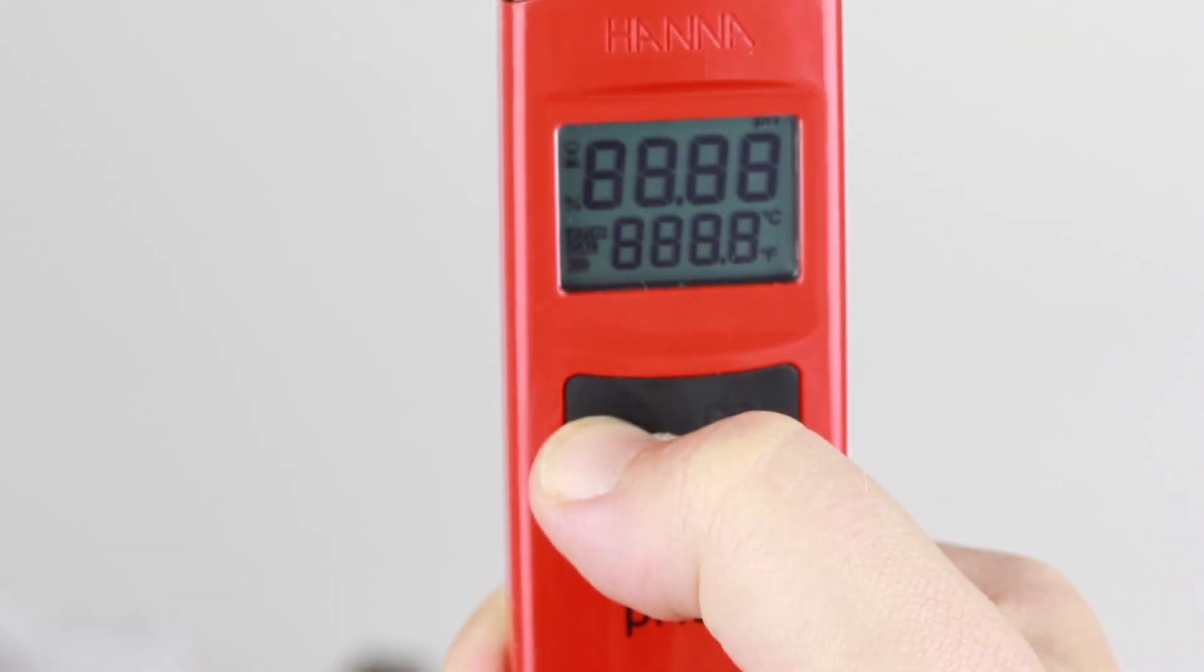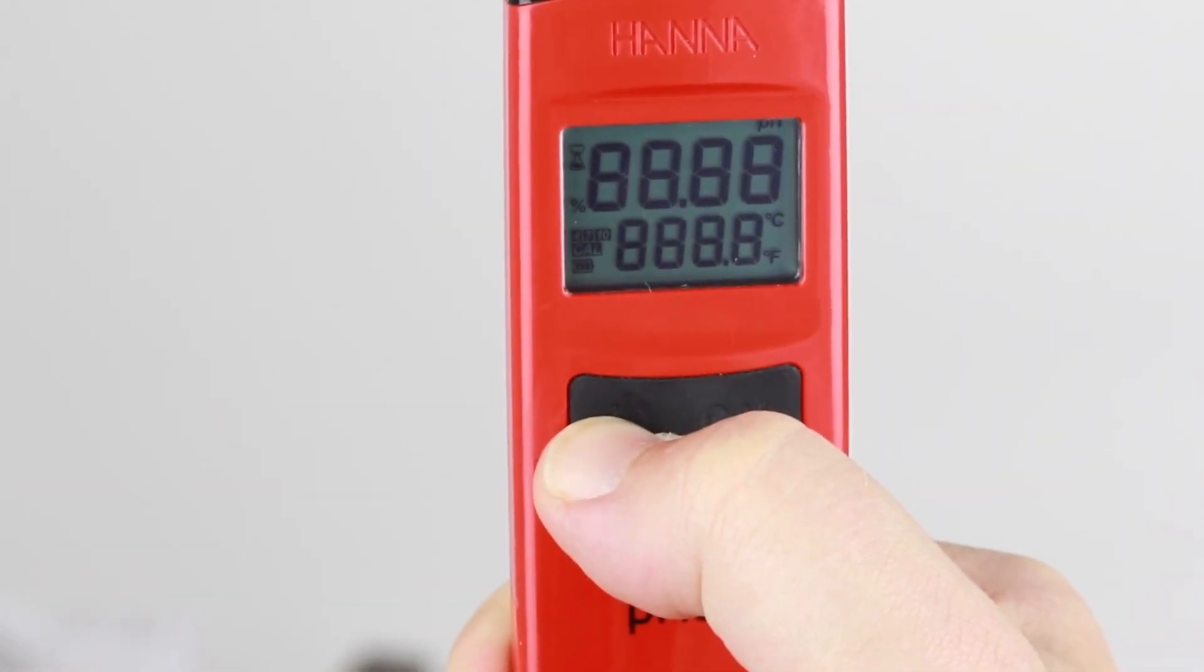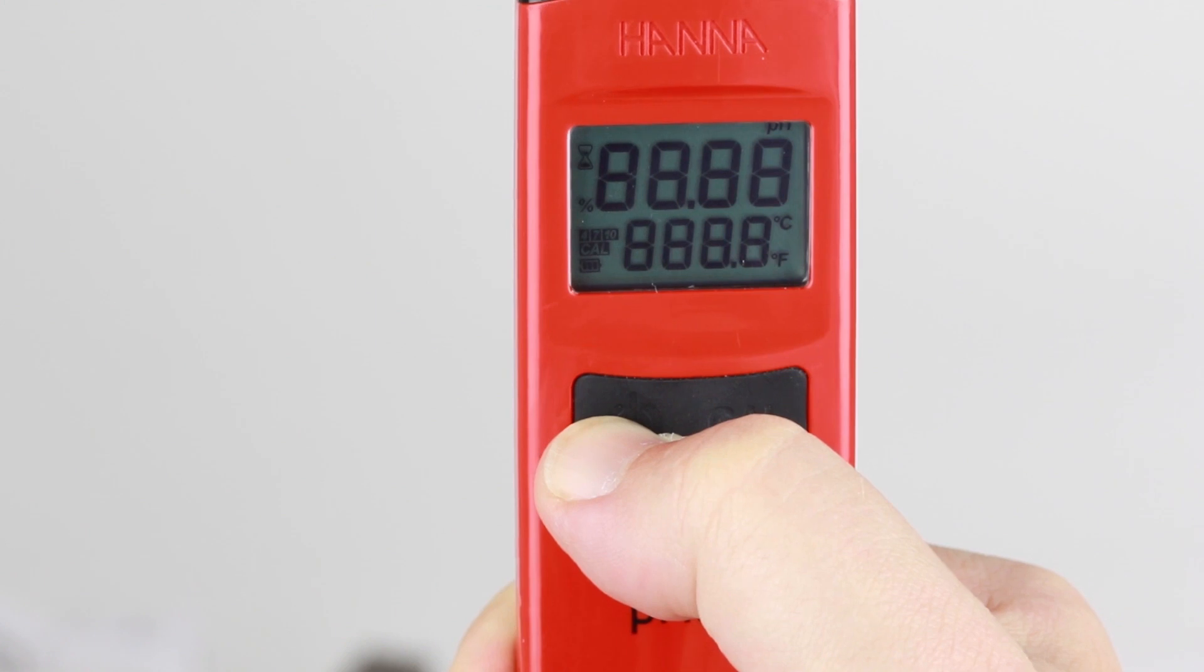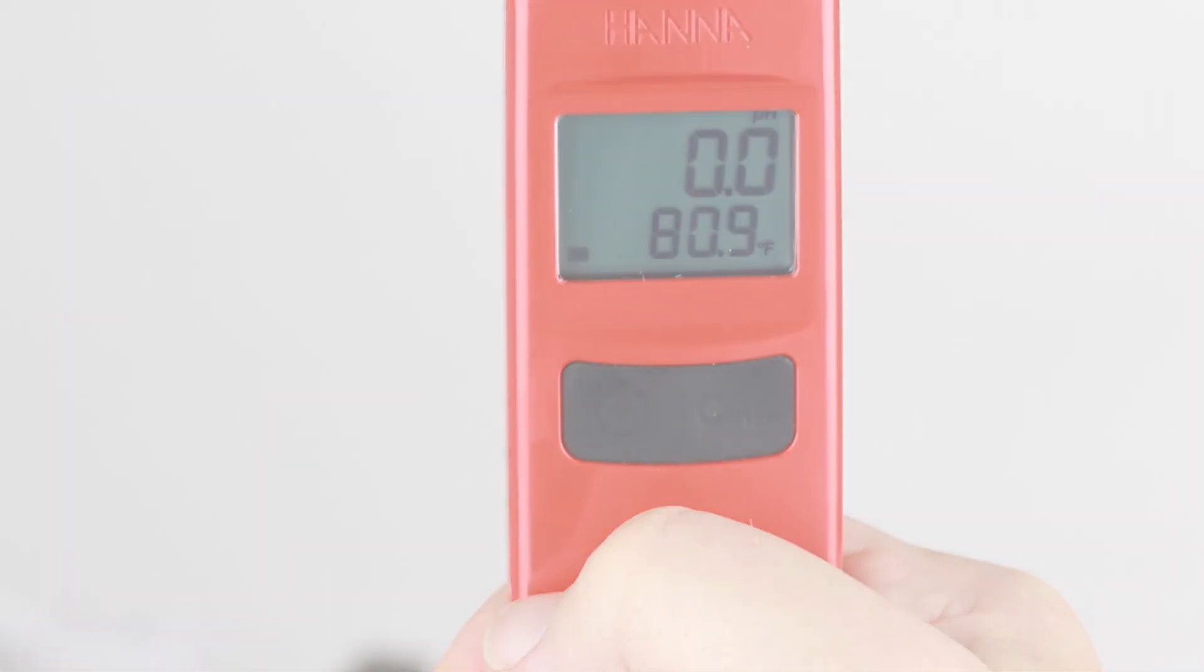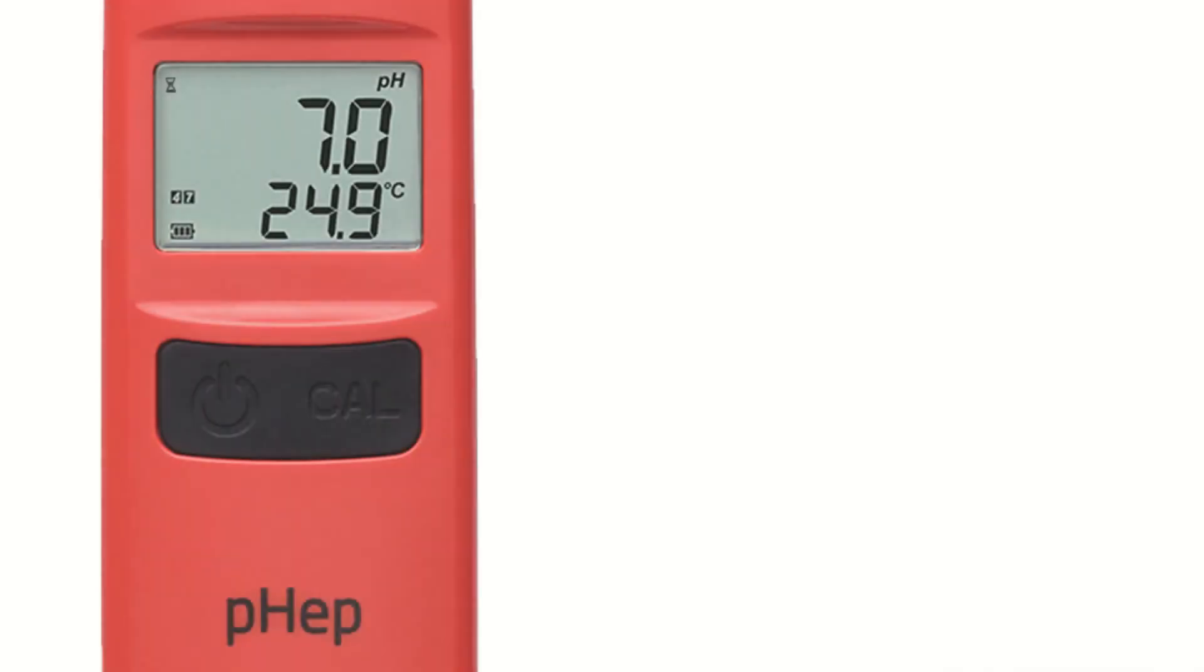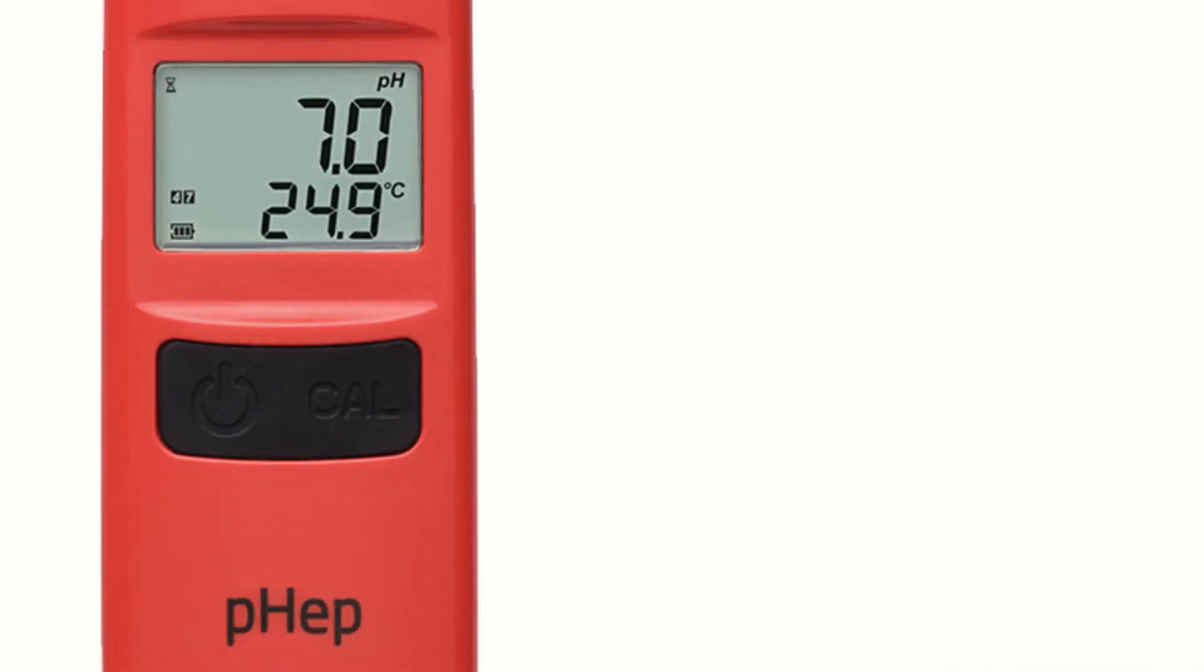To operate the meters, simply press the left on-off button to turn on. All the LCD segments are displayed, then the battery percent level, notifying the user of the remaining battery life. In operation mode, the following can be seen.